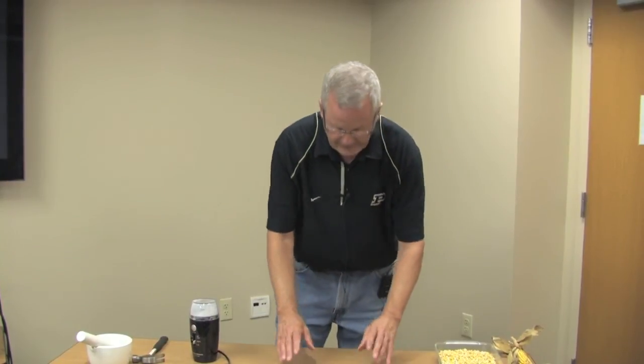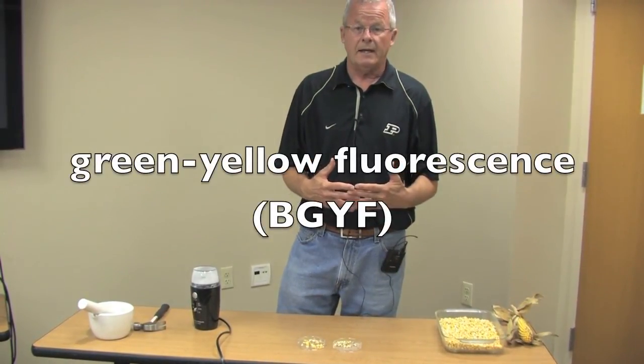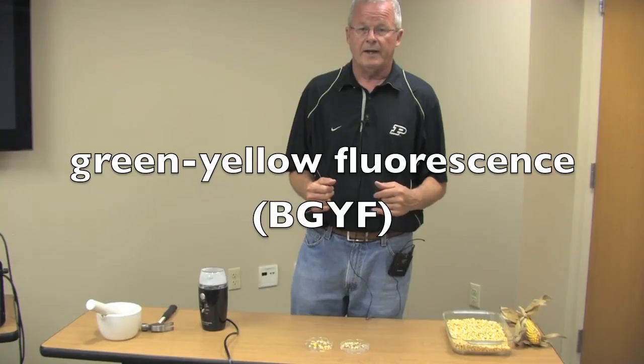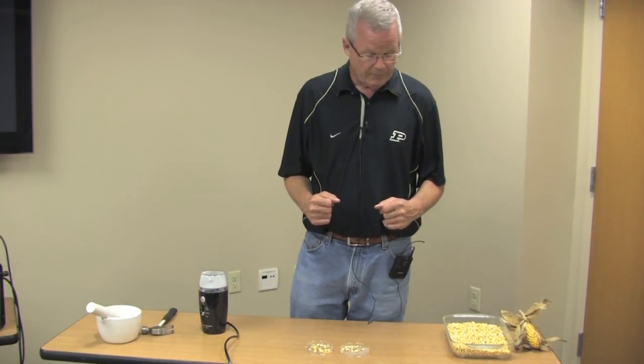Once your kernels are broken, you can place them under the light and examine them for fluorescence. That fluorescence will be a green-yellow fluorescence — we call this bright green-yellow fluorescence, or BGYF. And if you detect it in the grain sample, then you can assume that the pathogen Aspergillus flavus has been growing on that corn, and thus you should assume that aflatoxin contamination could be present.